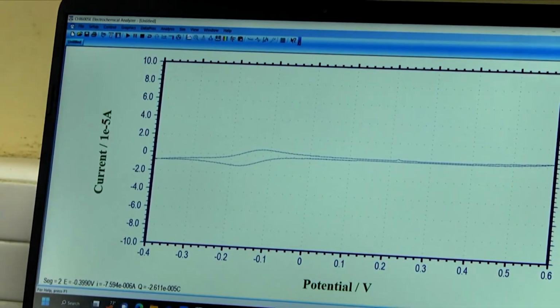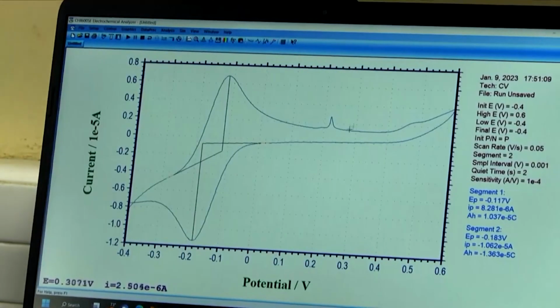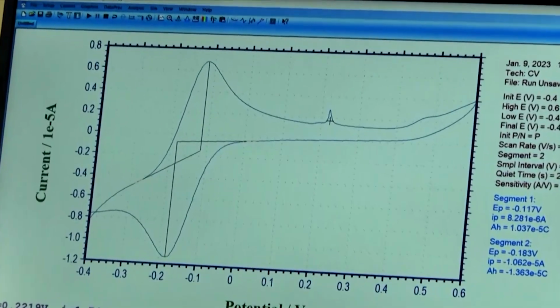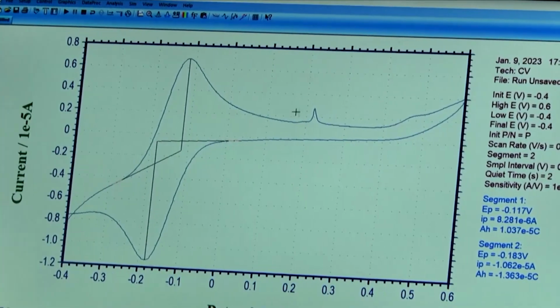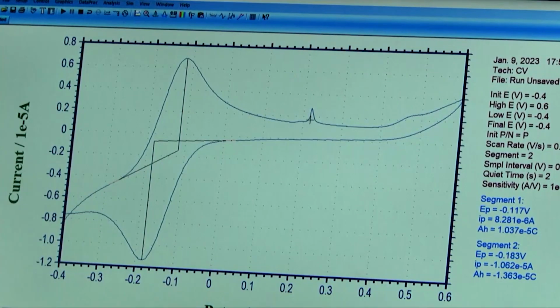Okay, so see, this is just for any kind of... see, this is also good that you got another small hump. This is just for maybe if you have any impurity in your surface or your solutions, because this electrochemical sensor is very sensitive. So you may get this kind of peak. Maybe some kind of impurity, then it's good that you can see something.